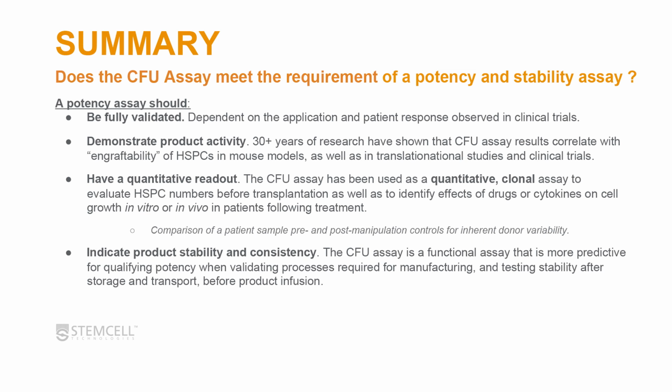Does it demonstrate product activity? Well, I think this is also an easy yes, because again, more than 30 years of research have shown that the CFU assay correlates with engraftability. This was originally, of course, done in mouse models, but I've shown you evidence and publications that say, yes, this also is true when you move into translational studies and clinical trials.